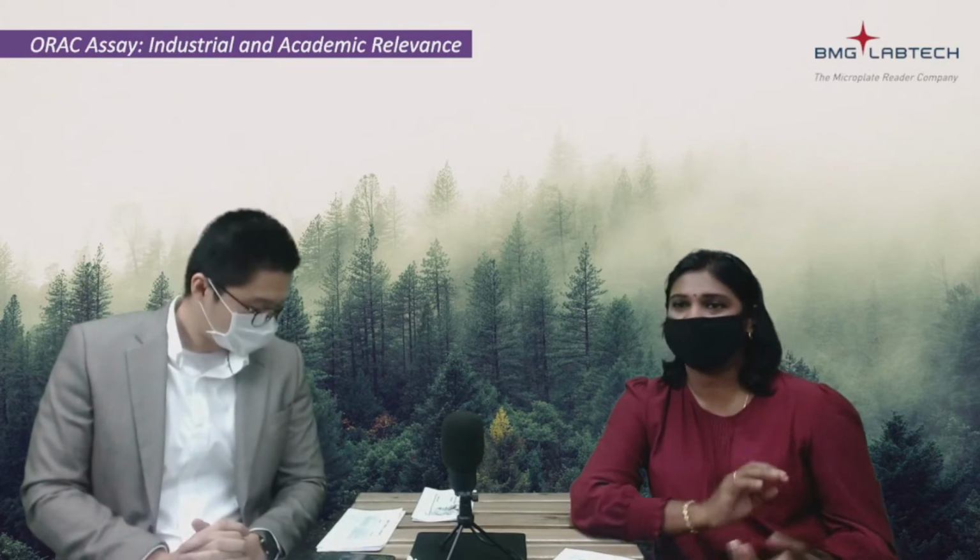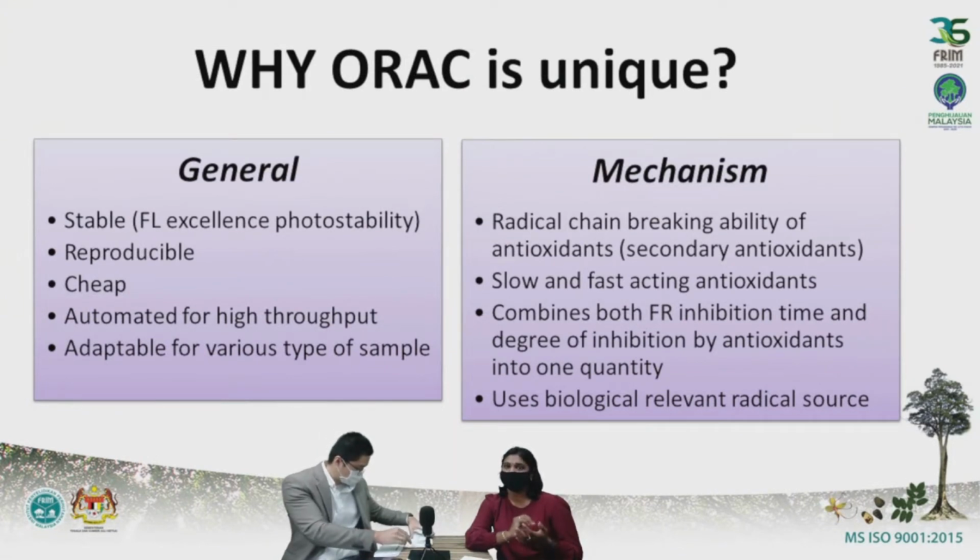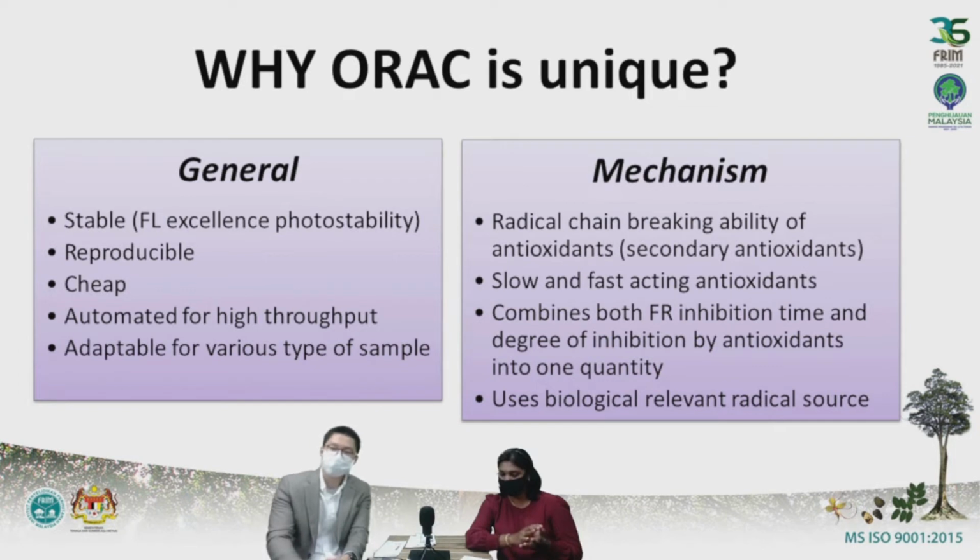Actually, ORAC is a very unique assay, I would say, because in general it is very stable since it uses a fluorescent probe with excellent photostability. So the assay is very stable, ORAC is reproducible, it is cheap, and it is also designed to be automated for high throughput screening in the 96 well format and also the 384 well format. It is also adaptable for various types of samples, for example juice, extract, and also biological samples.